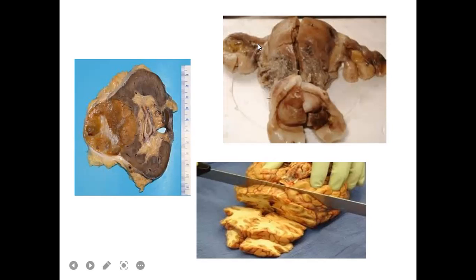This one is a uterus. Attached to it are the fallopian tubes. It also has its ovaries, the cervix, and even a part of the vaginal canal. So I have to indicate that. What else? This is a brain tissue.